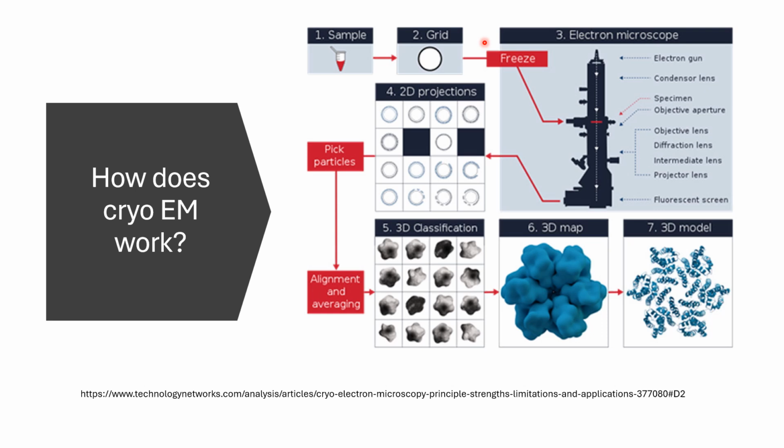Individual particles within the images are identified through particle picking and a large data set of particles is collected. Computational algorithms are then employed to reconstruct a 3D density map from the particle images.